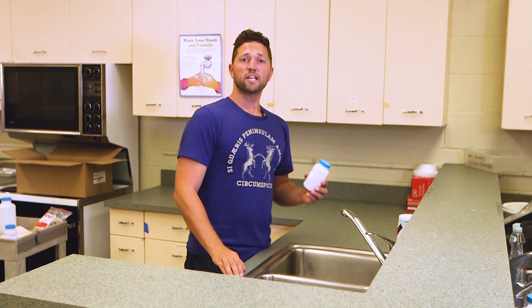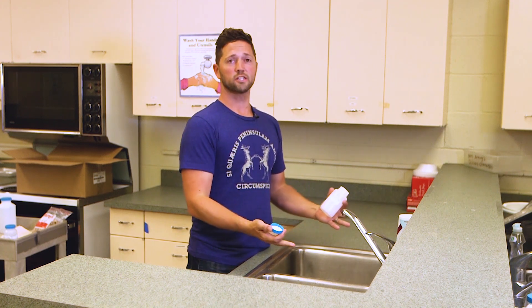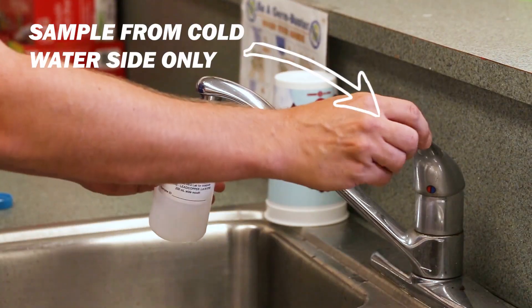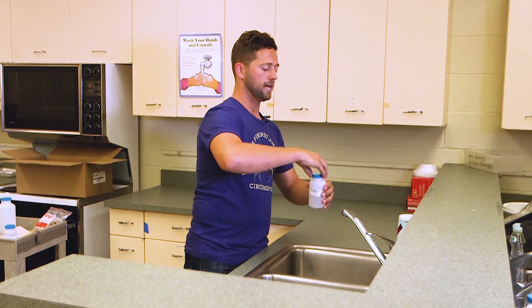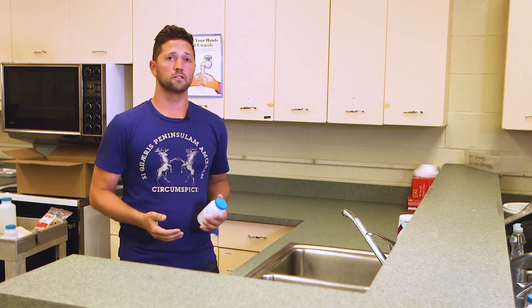Here at this next location, we're going to collect the sample similarly to how we collected the first one at the water cooler. However, we have a kitchen sink, so we've got to make sure we collect only the cold water side. We're going to fill it up to the neck again, cap it securely, put the paperwork with it, and now let's move on to do some more sampling.